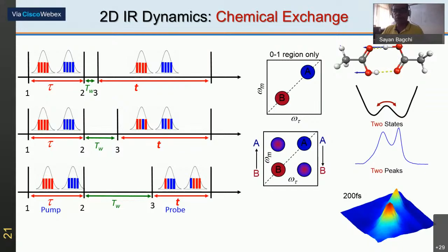because it is either hydrogen bonded or not hydrogen bonded from time to time, we'll have one peak where some molecules are hydrogen bonded, and in the ensemble some other molecules are non-hydrogen bonded. So this time average spectrum will show us two peaks. But it will never tell us the time scale of going back and forth, the time scale of this interchange or chemical exchange.